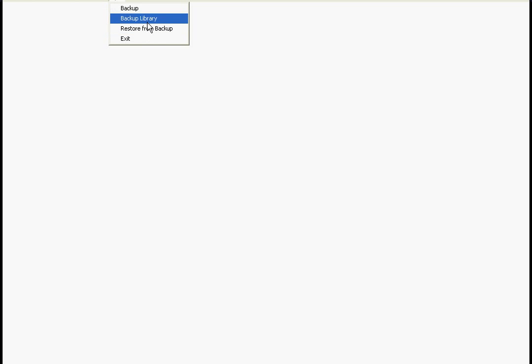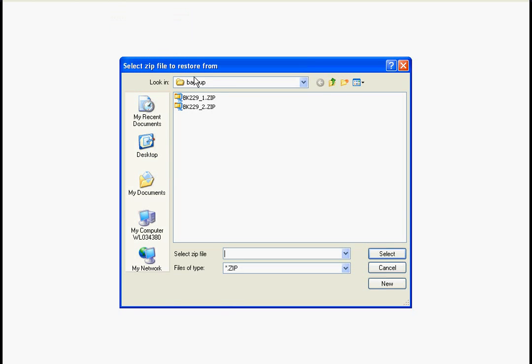When we take a backup, the backup is stored in a folder called backup, and then it is stored like this. So on 22nd September I took the first backup. It contained all those files. Then on 22nd I took a second backup, and so on. So you have multiple backup files, and you can go on checking which file has the correct data. So this gives you a lot of options to ensure that in any condition you are able to restore the data.